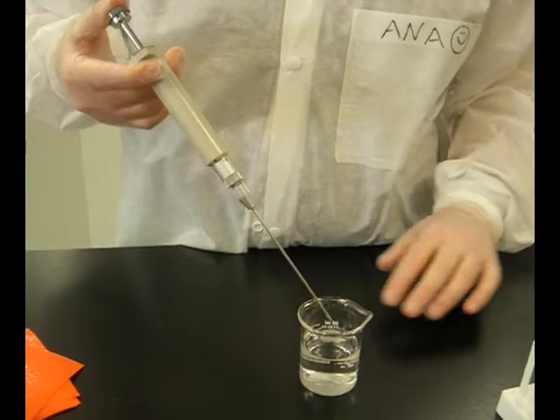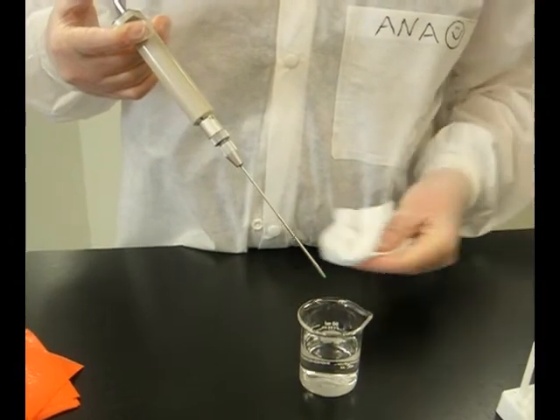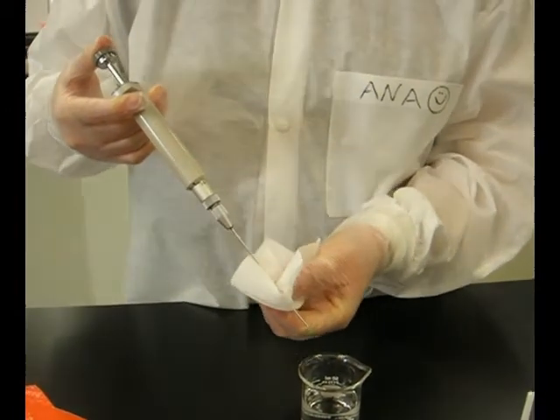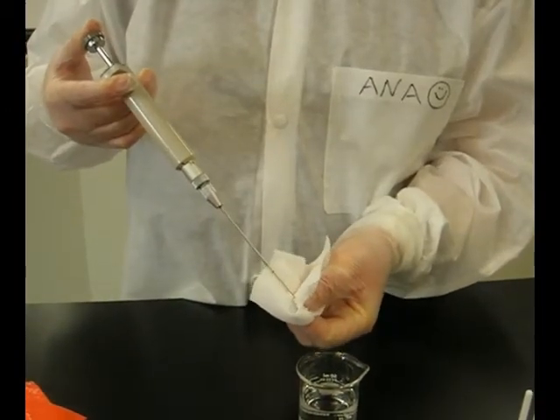Rinse the micropipette with deionized water a couple of times. With the plunger pressed all the way down, remove the pipette from the water and wipe it well, especially the plunger tip.